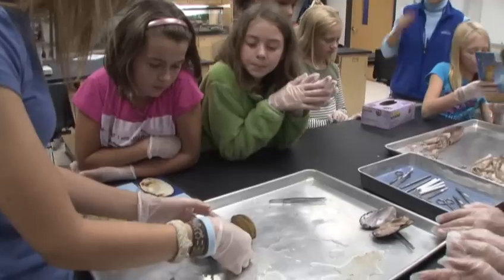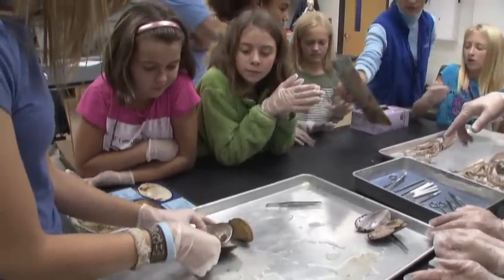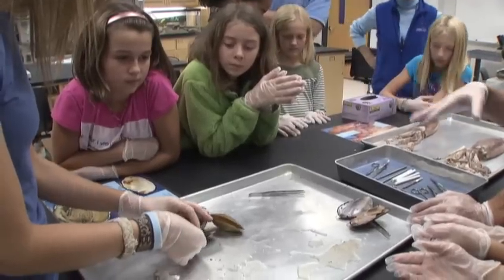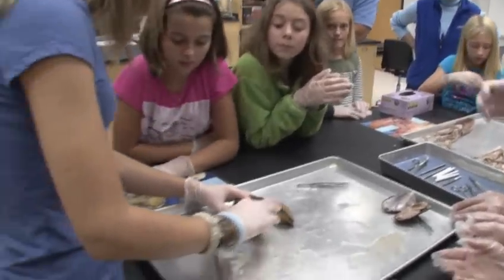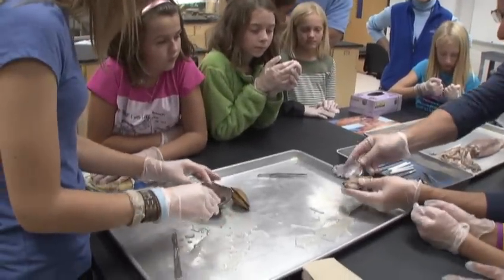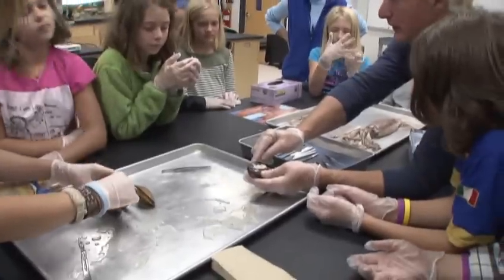And that's where the water goes into little tiny tubes, and it filters out oxygen and gets rid of the carbon dioxide, and it also traps food with these little tiny things called cilia. They're like little hairy things, and they pass it on to the mouth. So you can always tell the front of the clam by looking at the umbo. This is the first baby part.